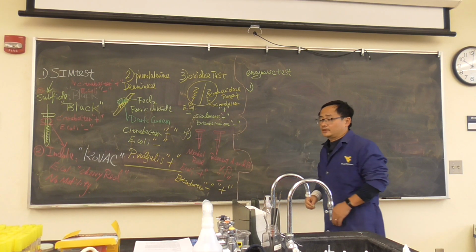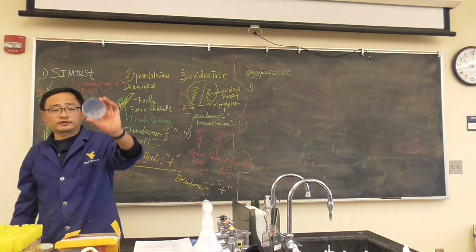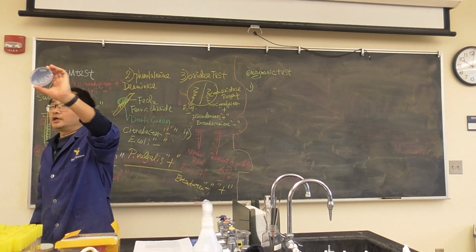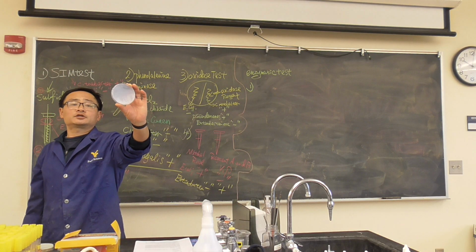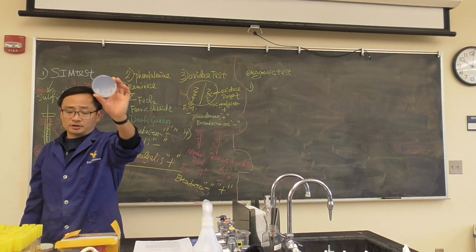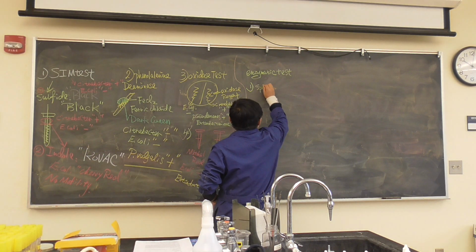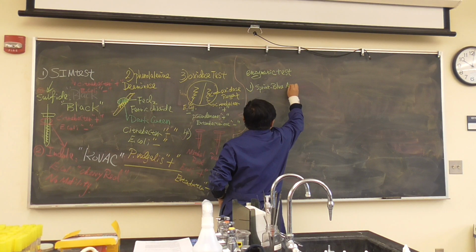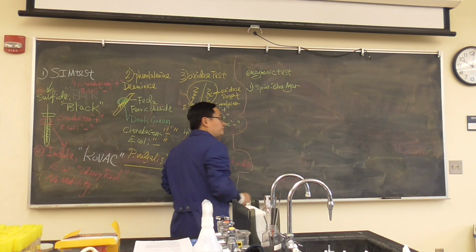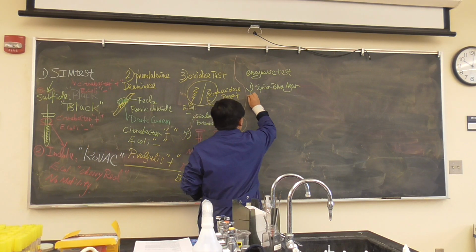First of all, we have one agar. It looks like this. A little bit blue. By the way, I don't think this was made very well, but it's okay. You can use it. It's called spirit blue agar. This is for testing whether bacteria can use fatty acids.